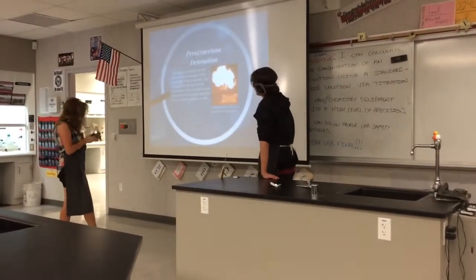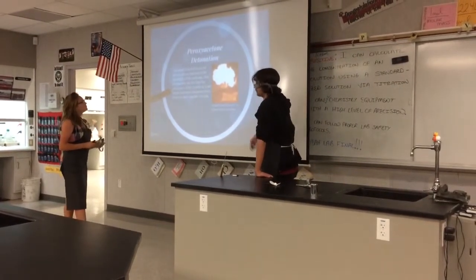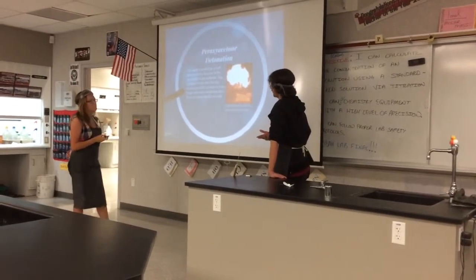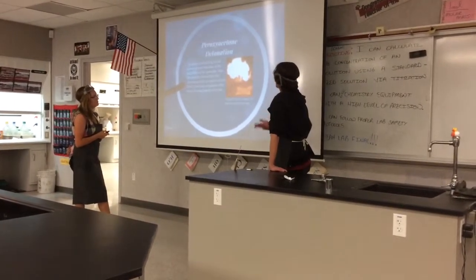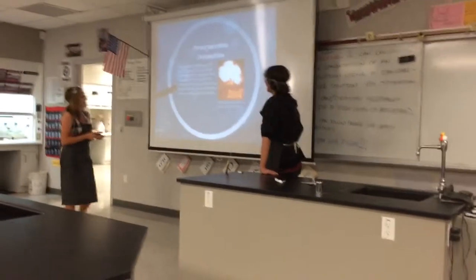So, the peroxiacetone detonation, it doesn't need very much to set it off. It's a primary explosive, susceptible to anything. If you drop it, it's going to explode. You poke it, it'll explode. So just don't touch it. It's going to explode. You're going to die permanently.